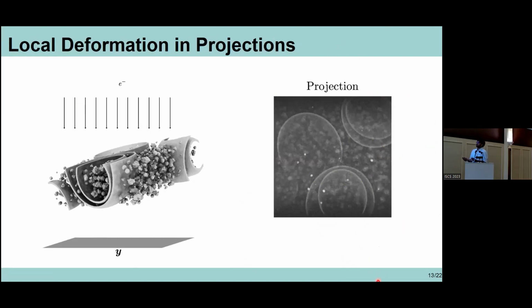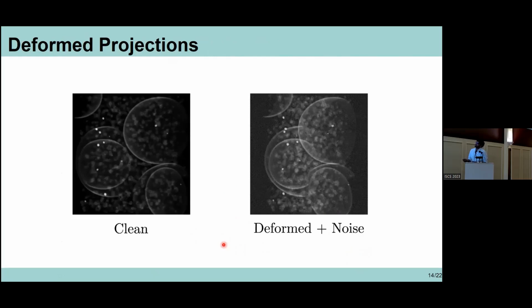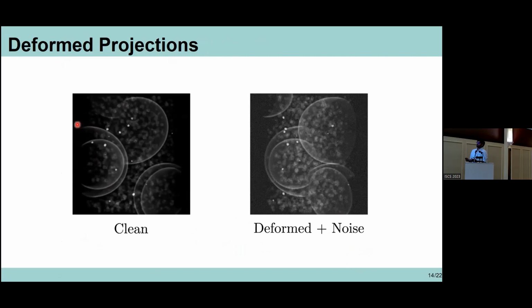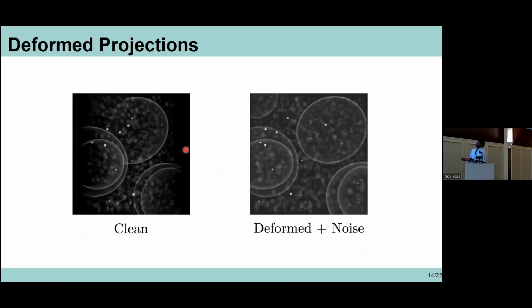For other deformations, we mainly look at tiny shifts at different locations of the projection. We model this using a time-varying shift operator, which you can see here. The different arrows show the displacement fields of various points of the projection, and this can be represented by the function gamma m. Now let's look at how these projections look when we account for all this modeling. First is the clean projection I showed you earlier, moving cleanly from one direction to the other. But when you see the real data, there are all these shaking artifacts which come into the picture.